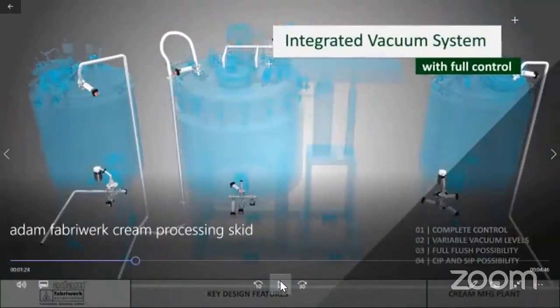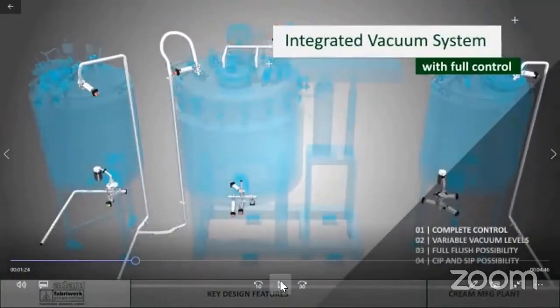All three vessels - the wax vessel, water vessel, and manufacturing vessel - are completely built with vacuum and are provided with an integrated vacuum system which gives variable vacuum levels, full flush possibility within the vessel. It ensures that all raw materials within the system are sucked by vacuum and there are no needs of specific pumps for sucking in raw material.